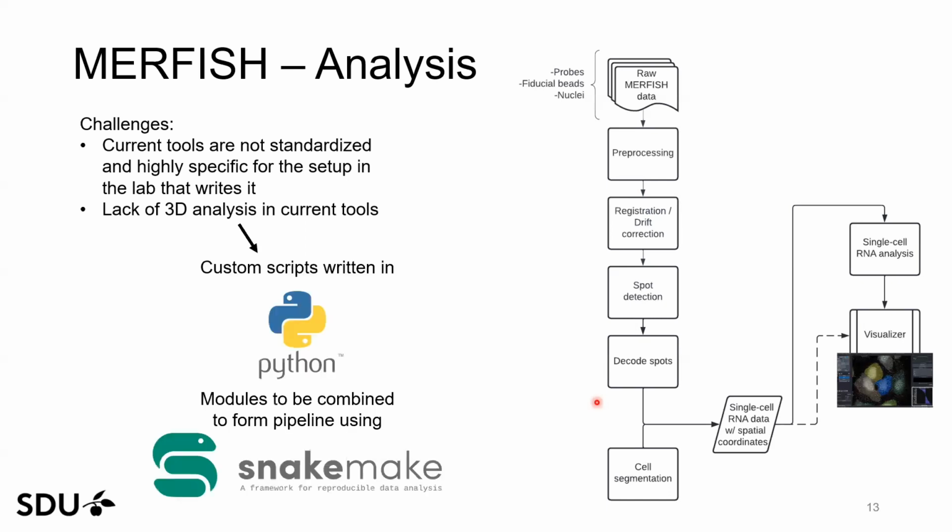So to solve this problem, we have written some of our own scripts in Python mainly. And then these scripts can be combined into a final pipeline using, for example, Snakemake. So I'll try to take you through some of these different analysis steps, until we get some actual spatial transcriptomic data.